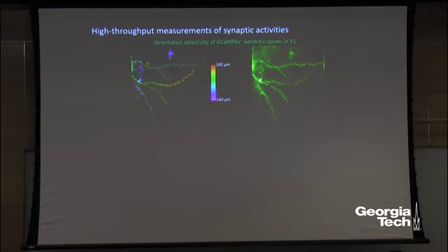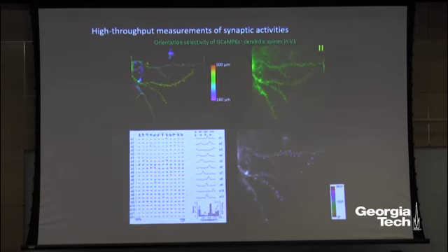But with the Bessel beam, you can now interrogate all the dendrites and dendritic spines in this volume in a single 20-minute experimental session. I apologize, the movie is compressed too much, so it's kind of fuzzy, but hopefully you can still see the isolated onset of the activities on those individual dendritic spines.